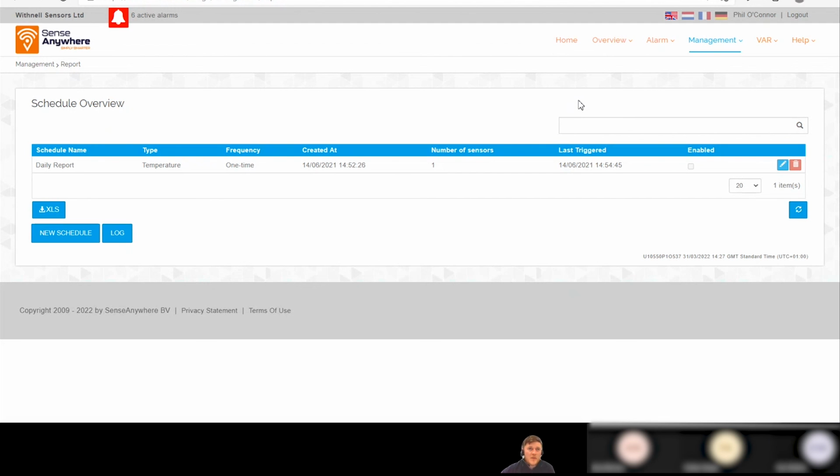The good thing is with mapping, there is a separate feature for mapping. I'll send you over a test mapping report we've run for a few of our sensors. It's a very good looking document. It's not just an Excel spreadsheet sort of thing. It will show you the graph, the full timestamp of each logger, and even, if you wanted to input them, the pictures of where these sensors are placed. It is a very, very good looking report.